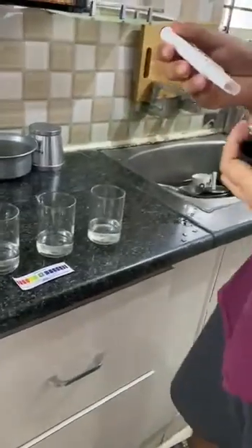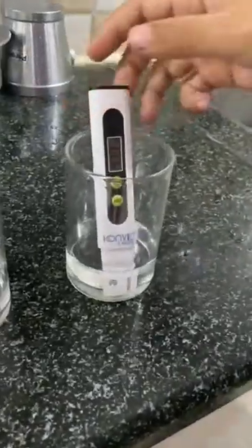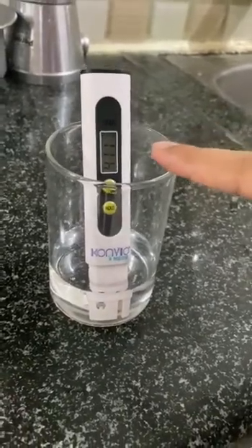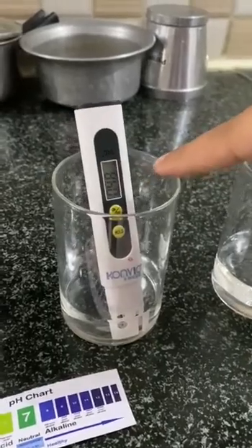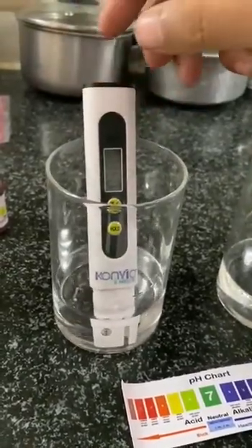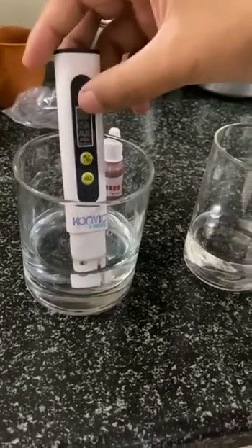So let's first check their TDS. For regular tap water the TDS is around 410, 411. For RO copper the TDS is around 48. For copper plus TDS is around 38. For RO water from municipal corporation it is around 39.